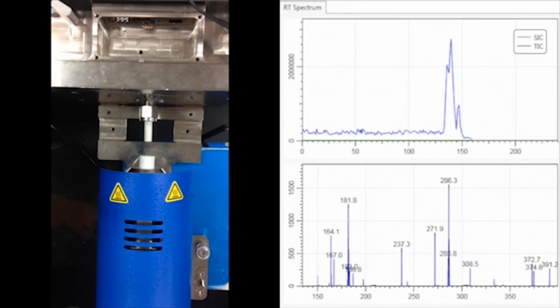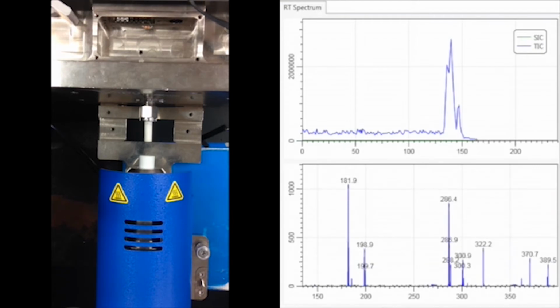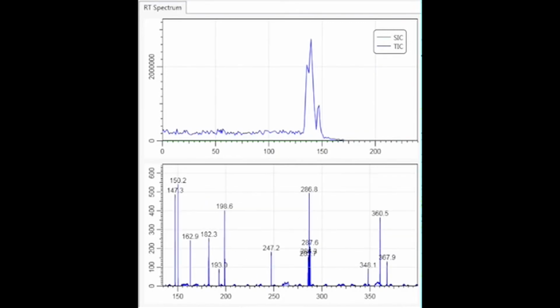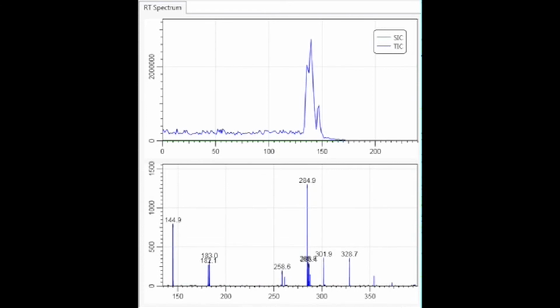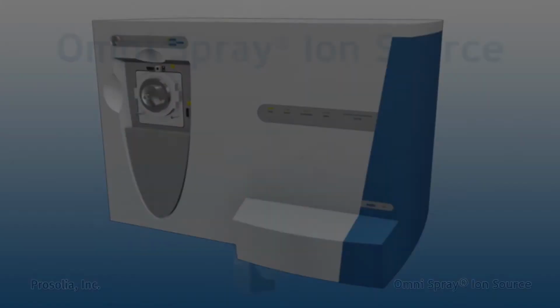Now, that looks like a chromatogram. It is not. There's no chromatography going on here, but it is the signal over time. The term people usually use for that is the chronogram. It's just a signal versus time. You can see when she shoved it in and when she took it out because the peak popped up and then it popped back. But it's not chromatography. It's just signal over time.